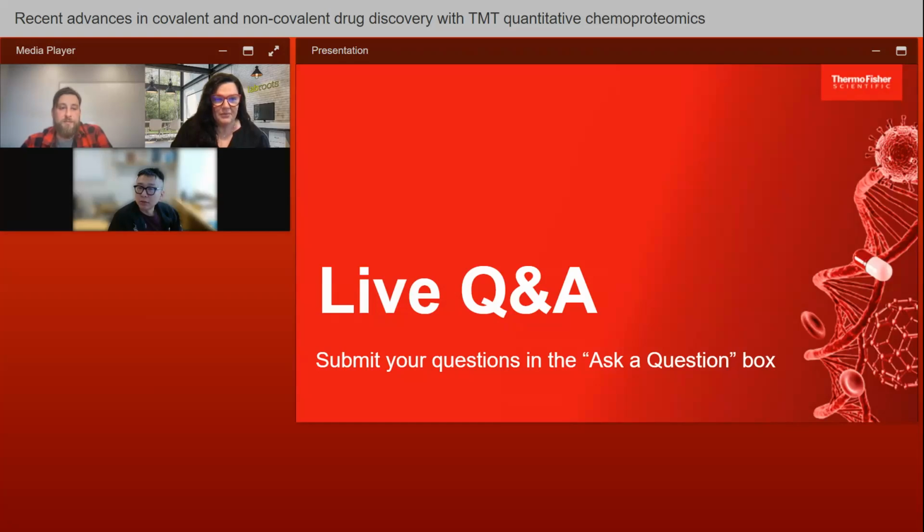Well, that's a really interesting question. I can give a shot first. Because TMT helps measure proteins, if you're talking about some malfunction of protein due to a genetic disorder, yes, it can help with that. But if you're talking about directly, for example, CRISPR or any other genetic therapy that directly goes after genes, there's not much for TMT there, because TMT is for proteins. Yeah.